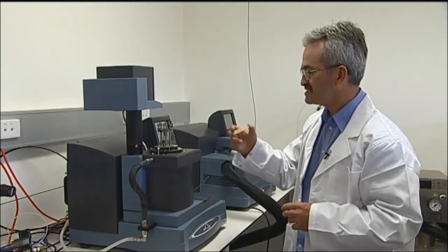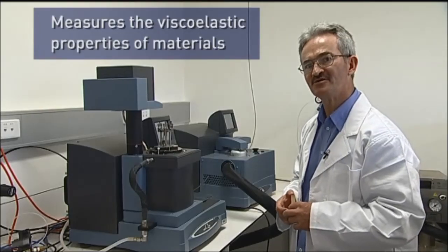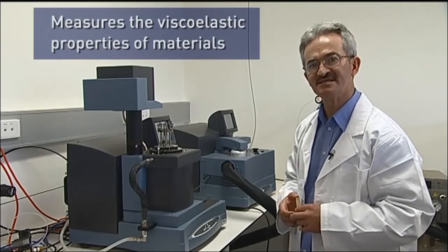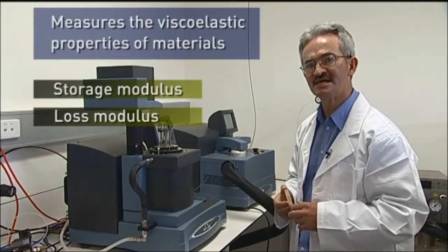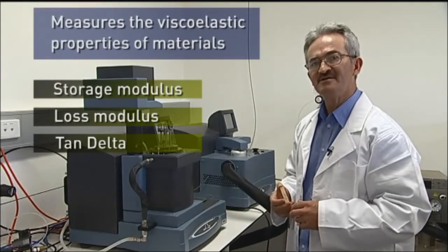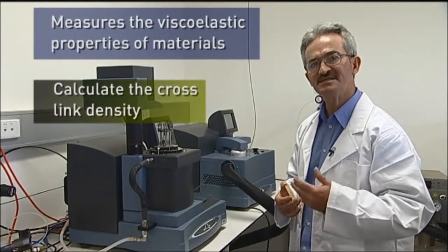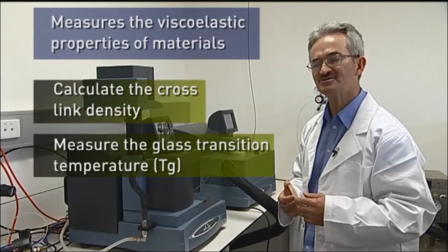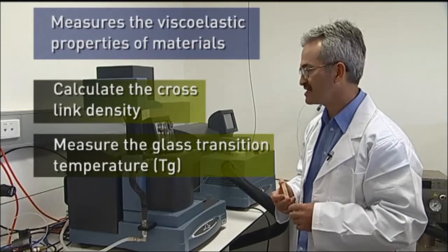With this instrument, we are able to measure the viscoelastic properties of polymeric materials, such as the storage modulus, loss modulus, and tan delta. From these values, we can calculate the crosslinking density and also measure the glass transition temperature of the particular polymeric material.